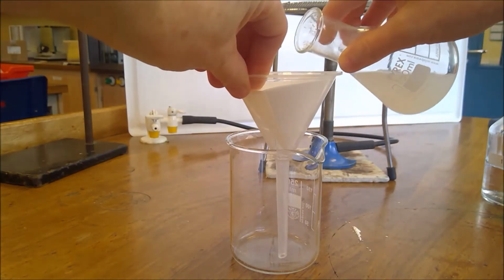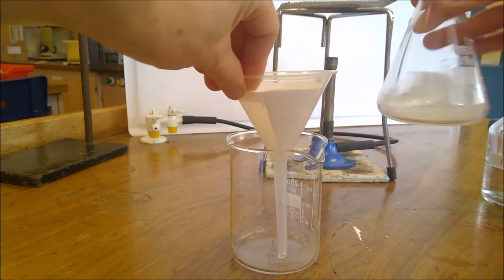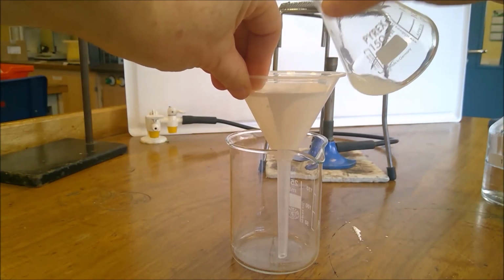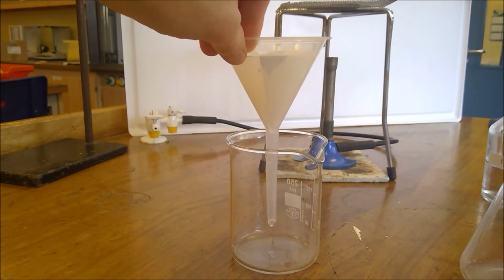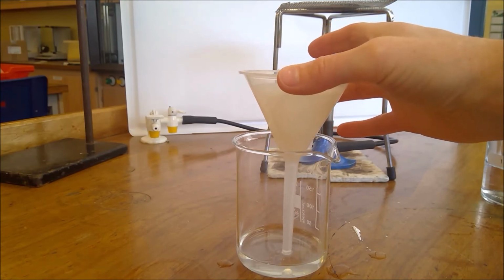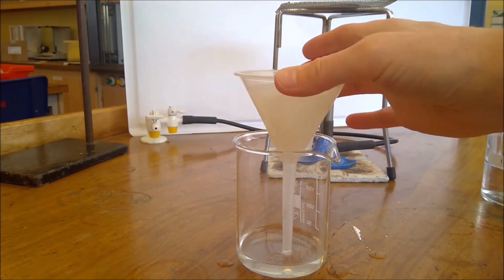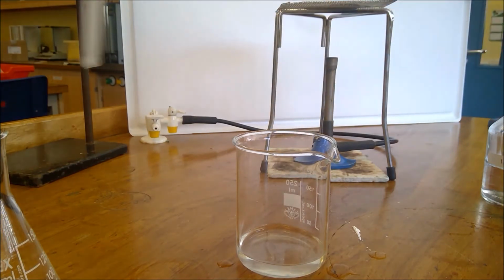So the insoluble excess magnesium carbonate should stay in the top in the filter paper, so that will be our residue, and our solution, which is now just our magnesium sulphate that we have formed, and the water is then going to come through. So we can see that dripping through nicely. Okay, so although we haven't quite finished all our filtering there, we've got plenty of solution at the bottom, as you can see. So I'm going to take my funnel out and then just put it back in the conical flask so that we can continue on with the next stage.